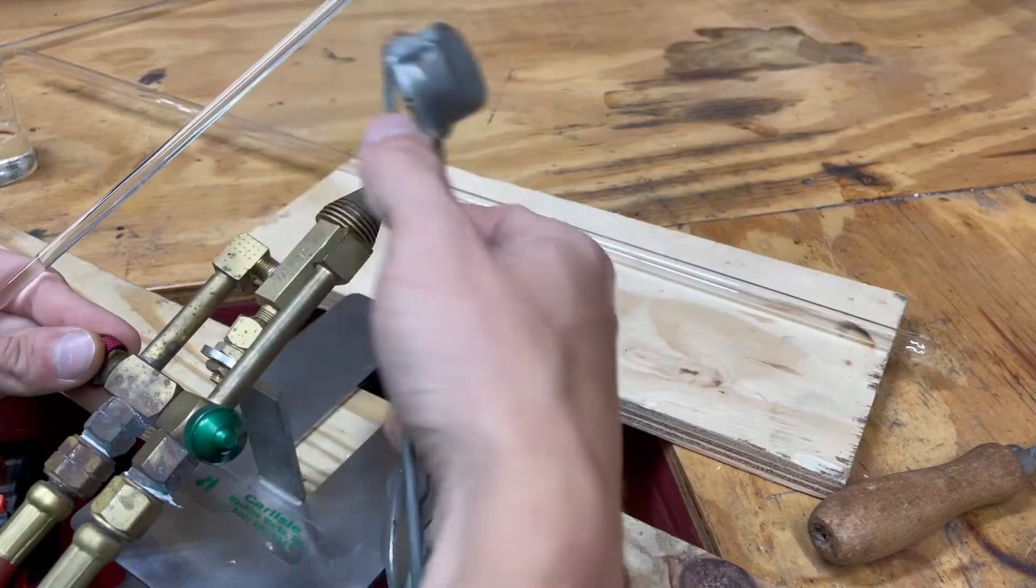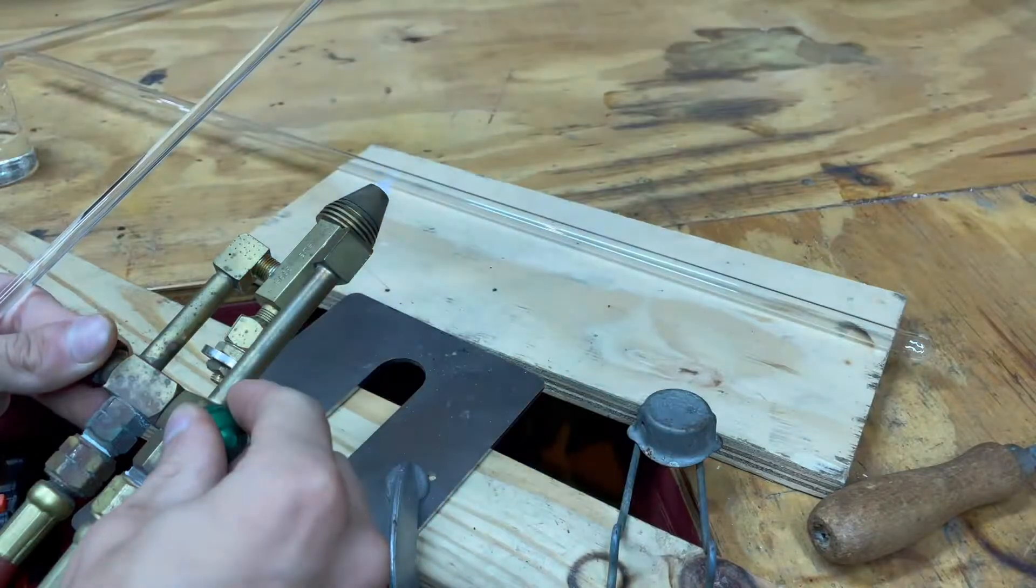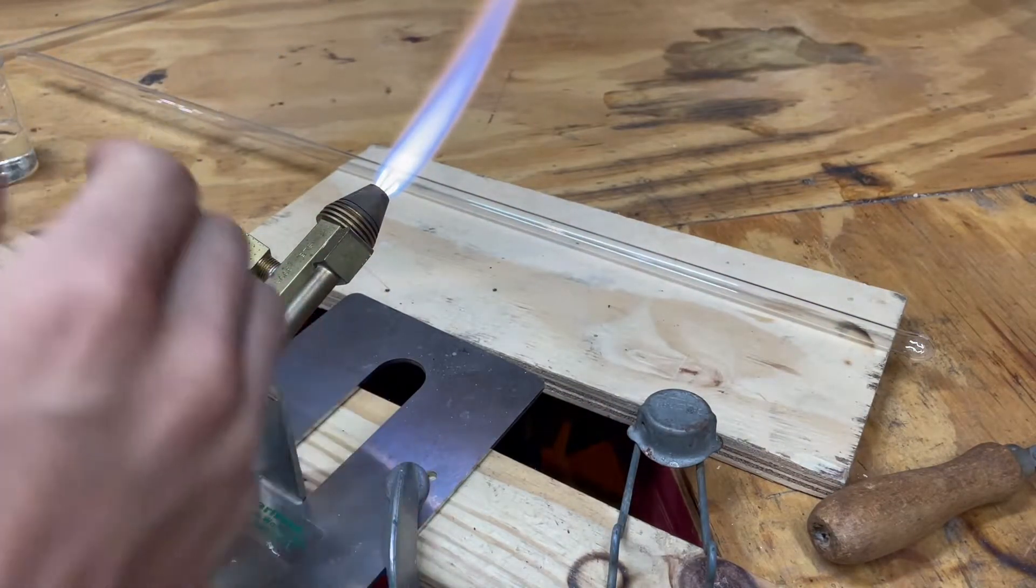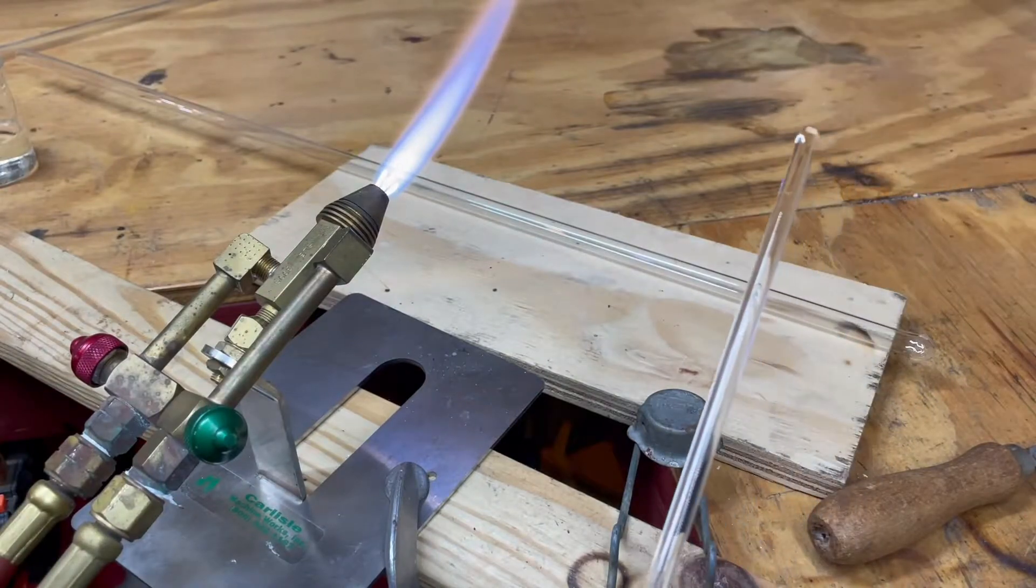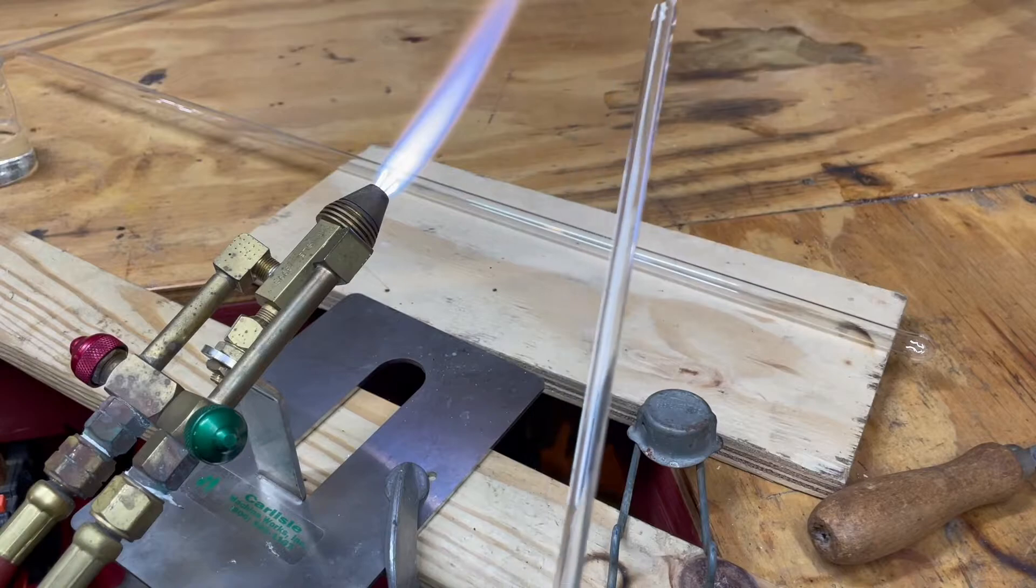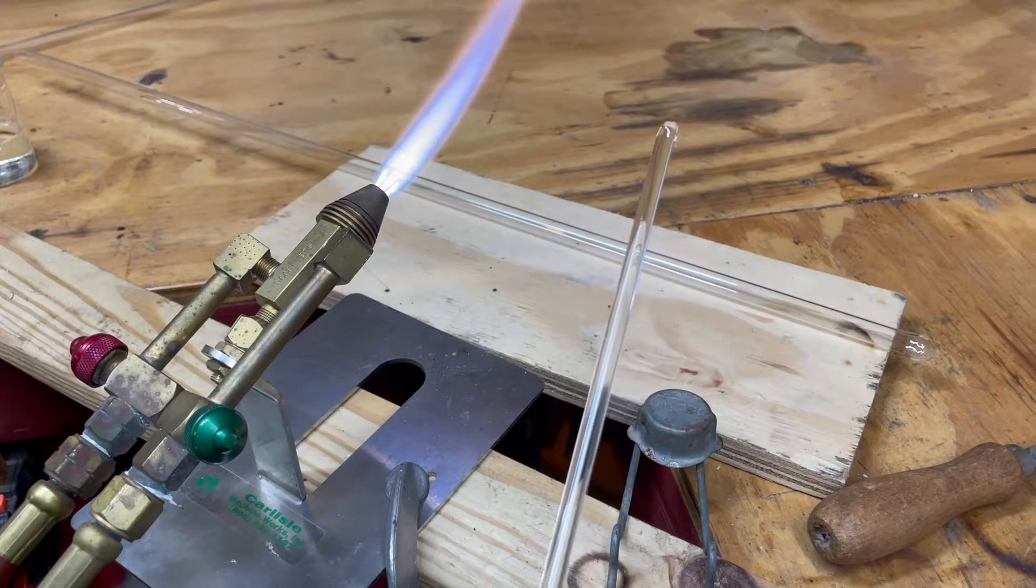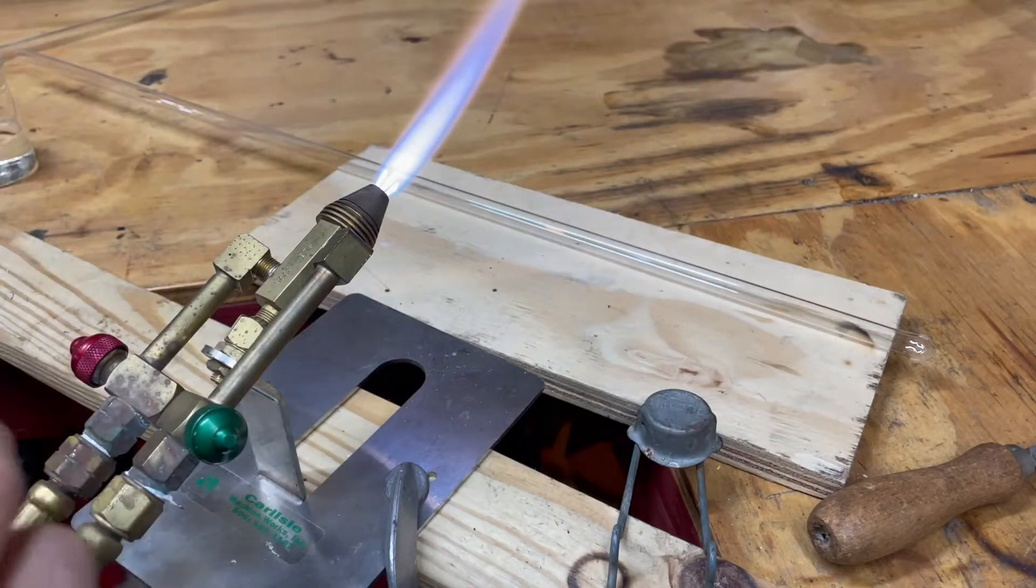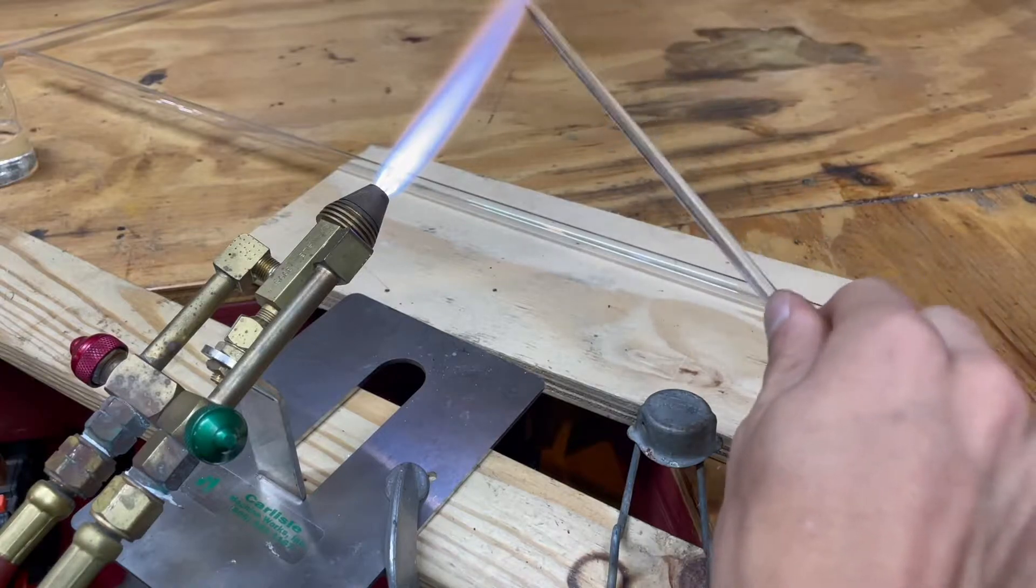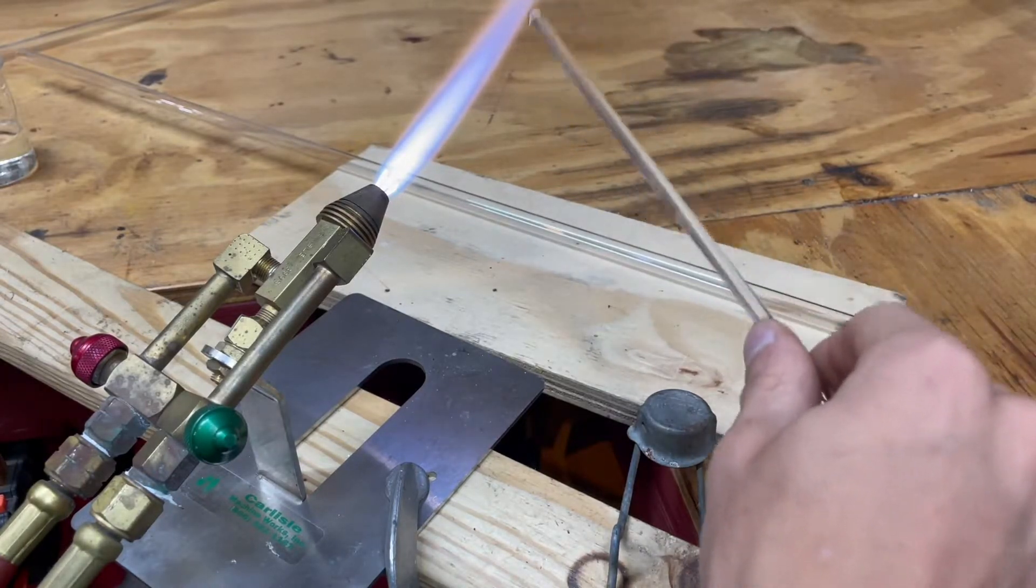For this you're just going to easily light the torch, get a nice flame glowing, and slowly add your rod to it. With glass it's a great insulator so the outside will melt but the inside will stay solid. This will cause the glass to crack and explode. So you're going to want to add it nice and slowly while rotating the glass. And start at the top and pass it in and out of the flame, slowly warming it up.